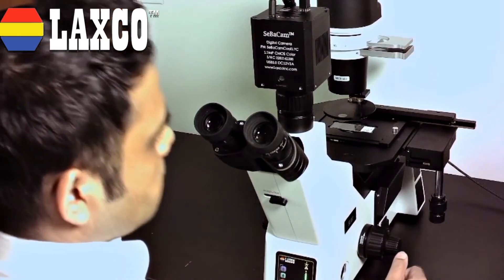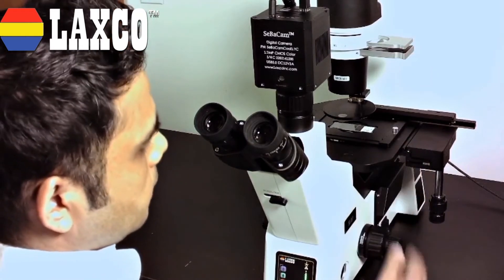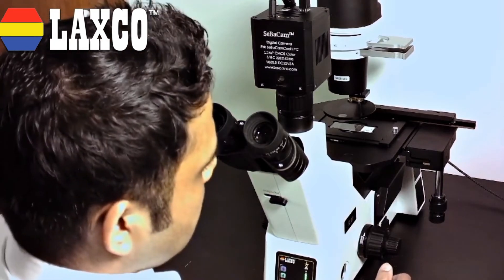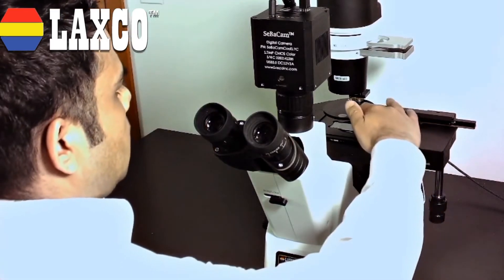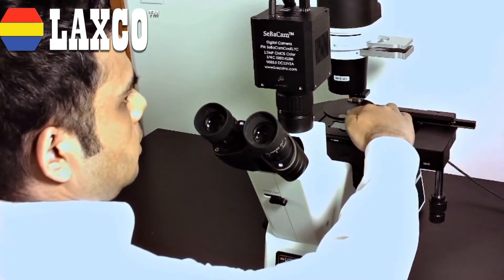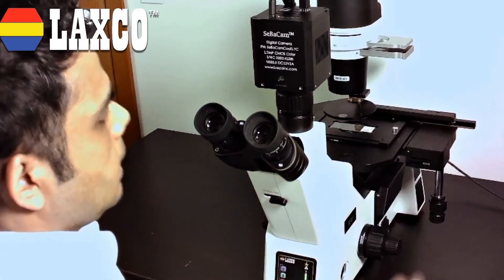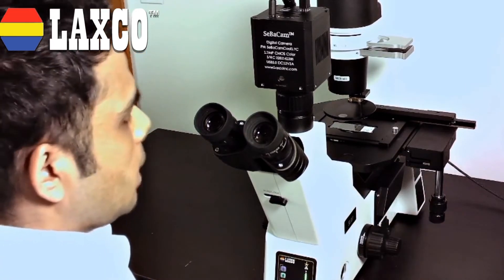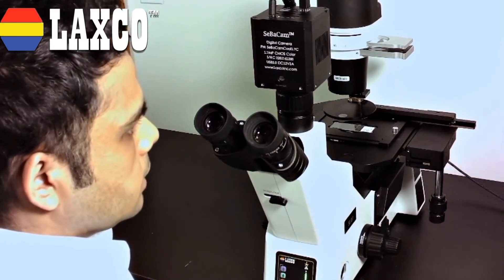This scope also has a mechanical stage on it. I have attached it for easier sample movement and manipulation. And there is also a dark room attachment here. It helps you to block out any stray light that might interfere with your fluorescence applications.